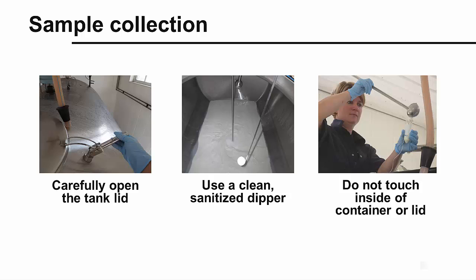After adequate agitation of the tank, carefully open the lid. Do not drop or disturb any of the gaskets or covers from the tank lid. Use a clean, sanitized dipper to get a sample. It is important to use a utensil or dipper that is clean and sanitized to avoid contaminating the milk.